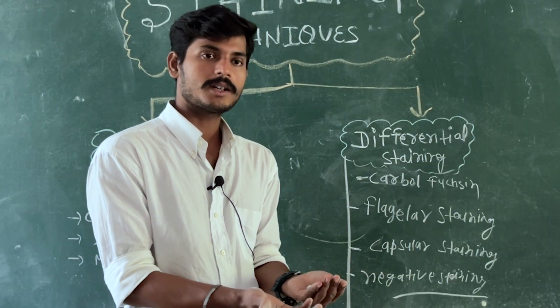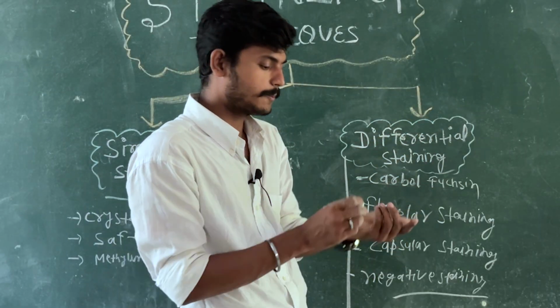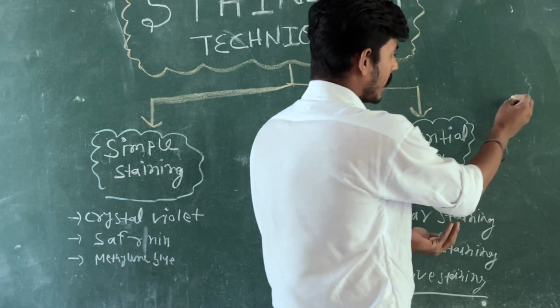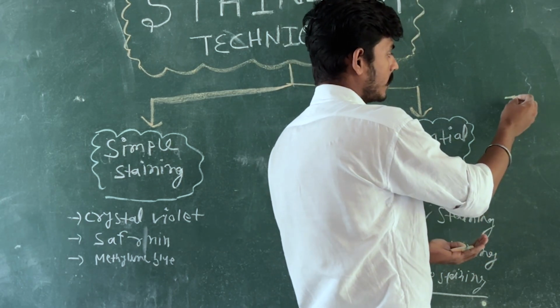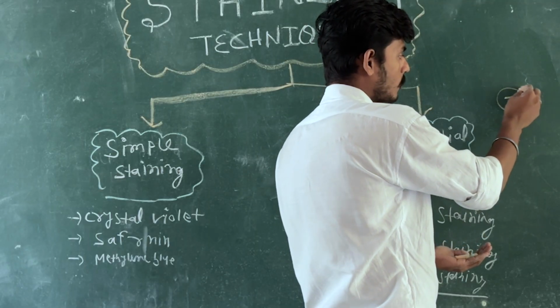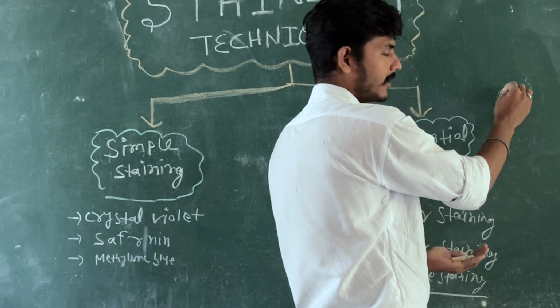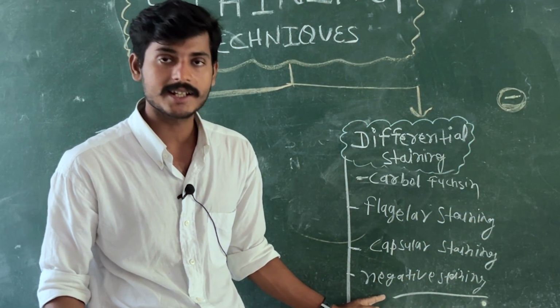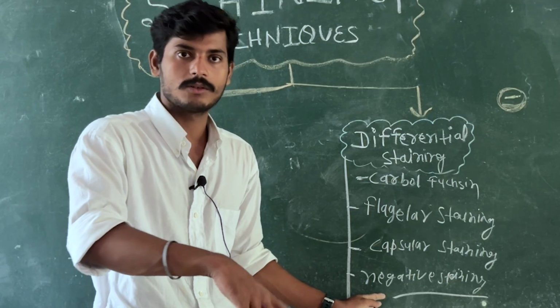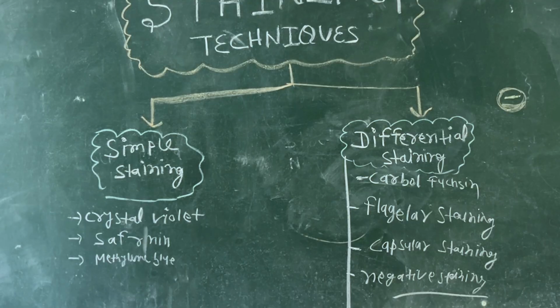तो अगर background को भी color कर दो, मान के चलो ये कौन सा color है, it's like a green in color, तो इस पे हम लोग yellow डालते हैं. ठीक, अगर येलो विजिबल नहीं है अच्छे से, तो इसके लिए बैकग्राउंड हम इसको रेड कर देंगे, तो रेड पे येलो चमकेगा. आई मीन दिस लाइक विजिबल. फाइन. So what we are doing in negative staining is that we are coloring the background, not the organism. So this is all about your staining technique. Fine.